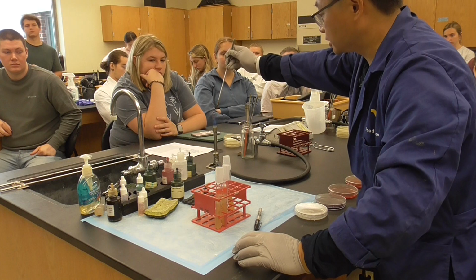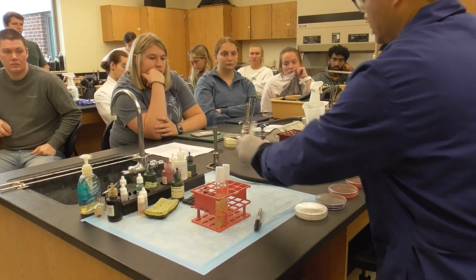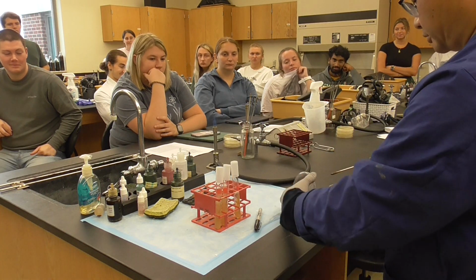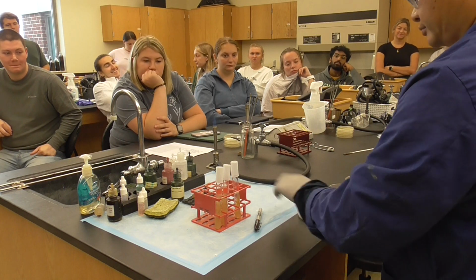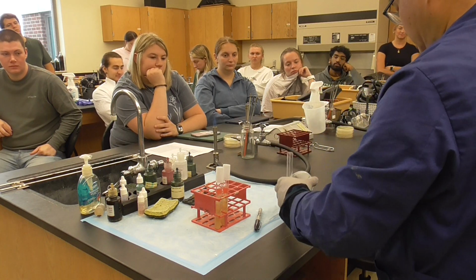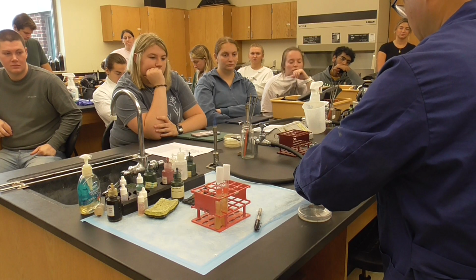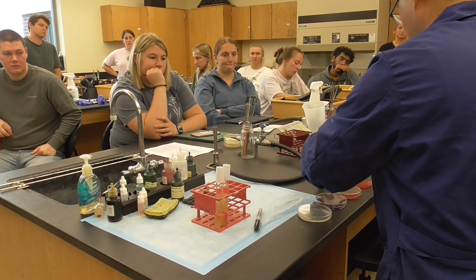Now the last one. This has to flame the loop. Okay. It's very important. Pick some bacteria right there. Don't break it. I have three more labs. If you break it, I don't have anything left. A little bit. It's good. Pick. Go here. A little bit. Flame. Pick. A little bit. Right here. Then flame. Pick. Right here.